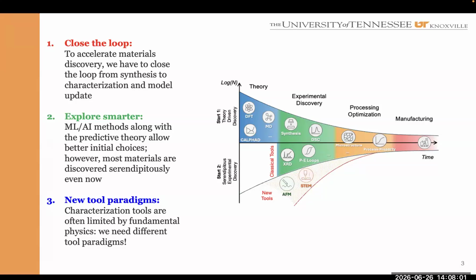Okay, then we meet the main point. To accelerate our experimental discovery, we believe that such microscopy techniques as scanning transmission electron microscopy and atomic force microscopy are very suitable methods that can at least complement and to some extent substitute the traditional integral characterization discovery. So why so?